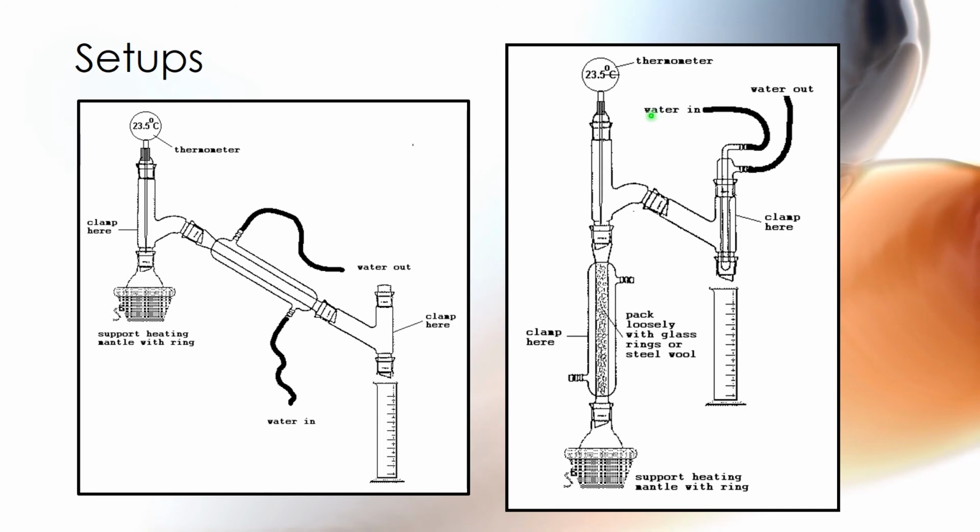And then for your fractional distillation, you'll use a different setup. Some of you will use the glass beads, others will use the steel wool that we have and pack it in here. Your column will go in there, your distilling joint there, thermometer adapter up here, and then you'll secure the same distilling joint you used here onto the distilling joint directly and put a cold finger condenser in where that stopper went in the other.